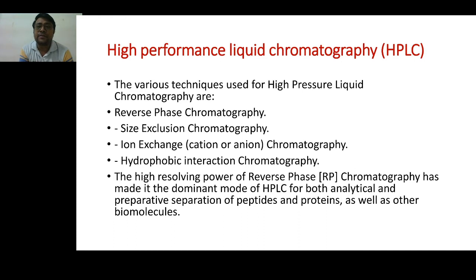The function of the stationary phase is to bind the components on its surface, which means it adsorbs the components on the surface. Then the role of the mobile phase is to unbind that material.